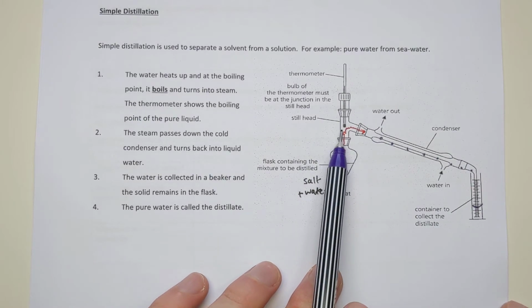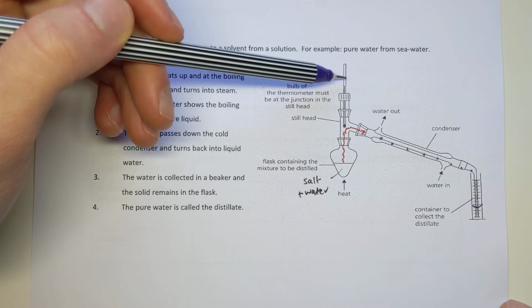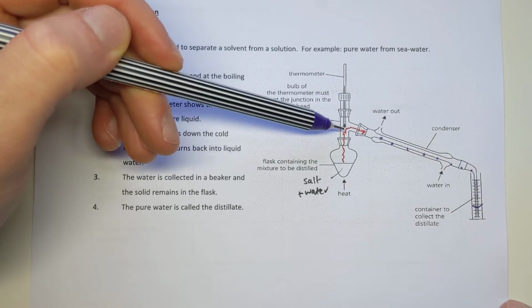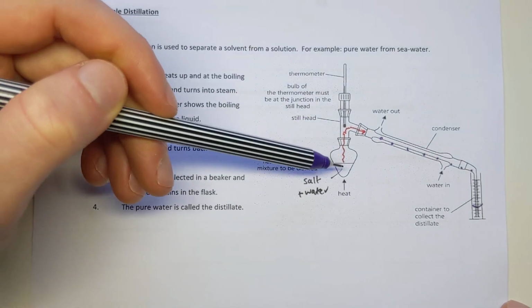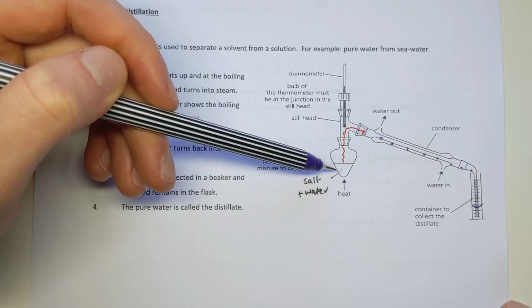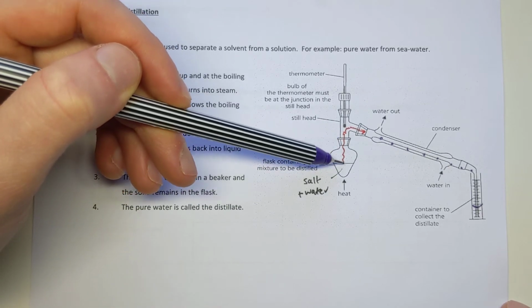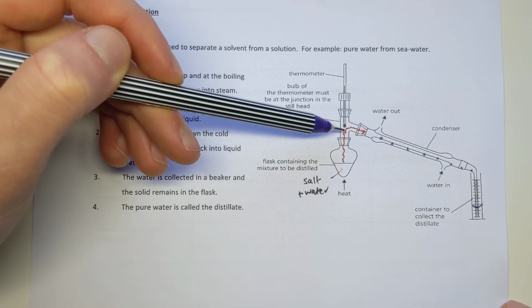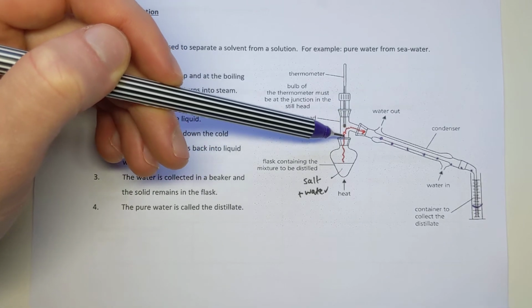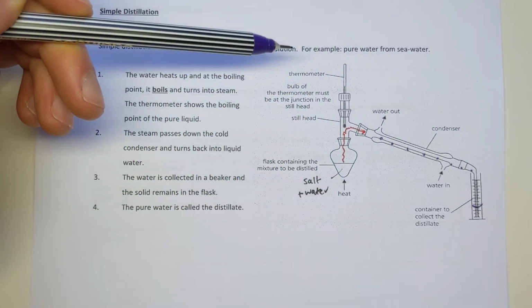And the thermometer is quite important as well for two reasons. First reason is that it allows us to work out what liquid we've got here. Now I know I told you that this was definitely water. I might not know it's water. The way I'd be able to confirm it is actually water is I know that water boils at 100 degrees C. Therefore, as this steam is moving past, the thermometer will probably read 100 degrees C. So it's a way of me telling what steam or what liquid was in this container.